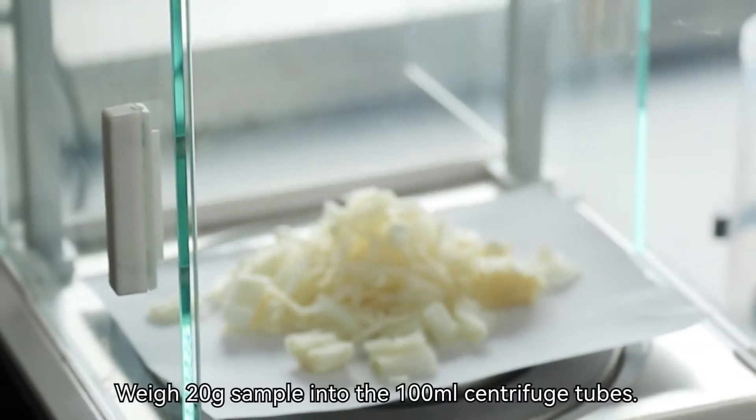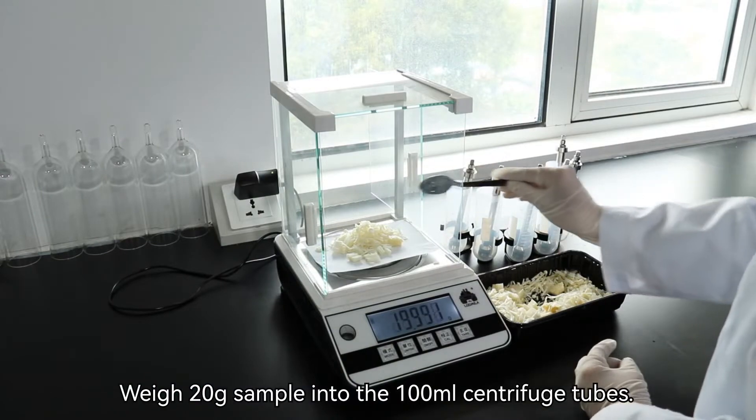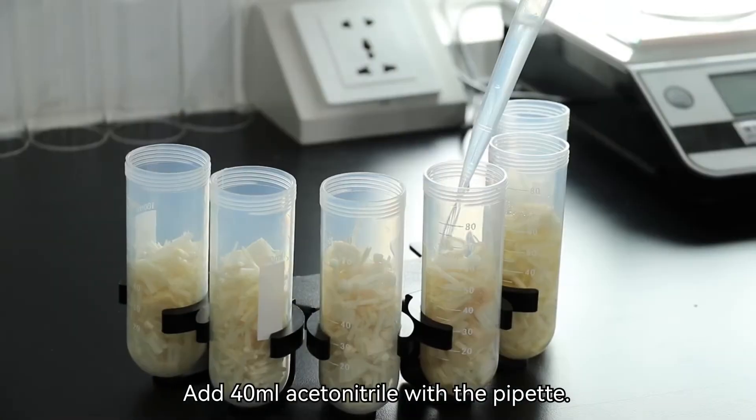Weigh 20 grams, accurate to 0.01 grams, sample into the 100 milliliter centrifuge tubes. Add 40 milliliters acetonitrile with a pipette.